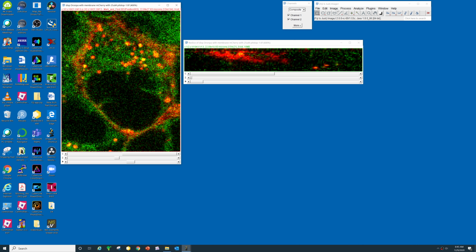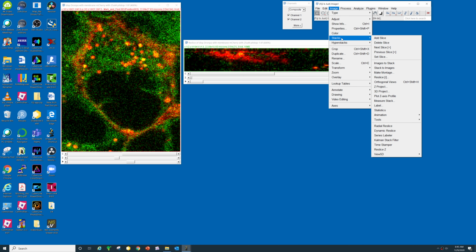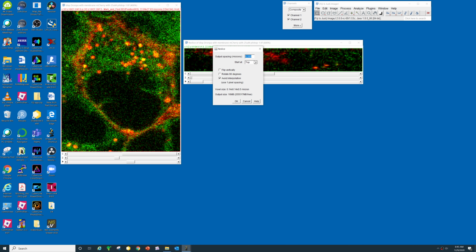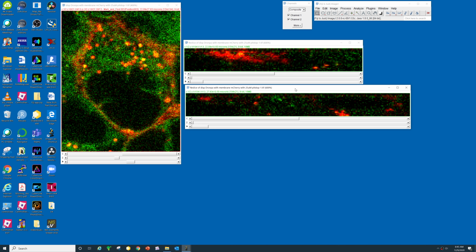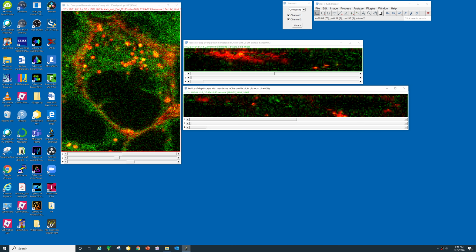And similarly, you can create the collection of YZ slices when you go from left to right. Our image is 154 by 194. That's why XZ slices are a little bit shorter and the YZ slices are longer.